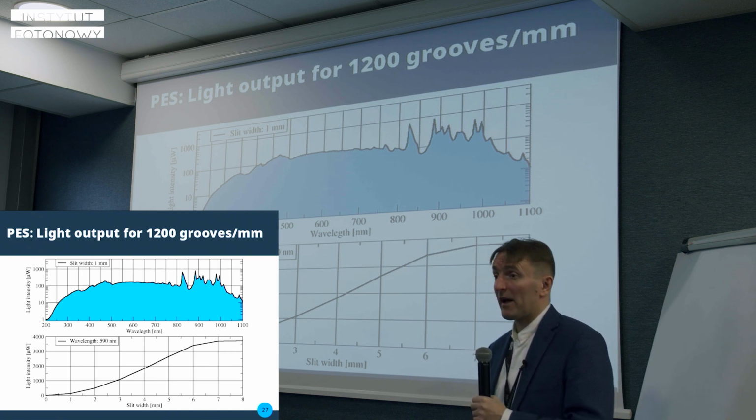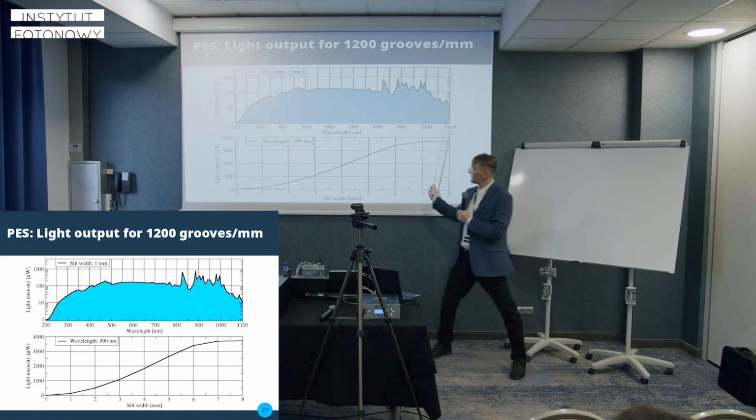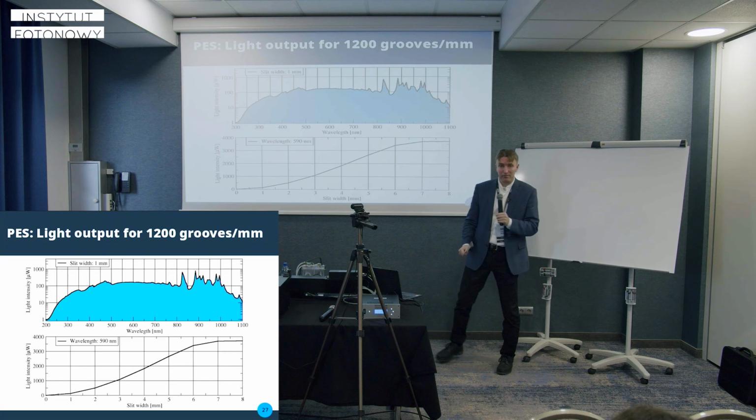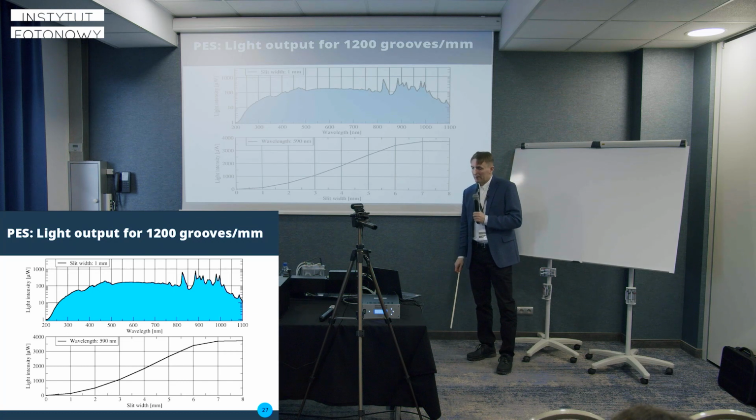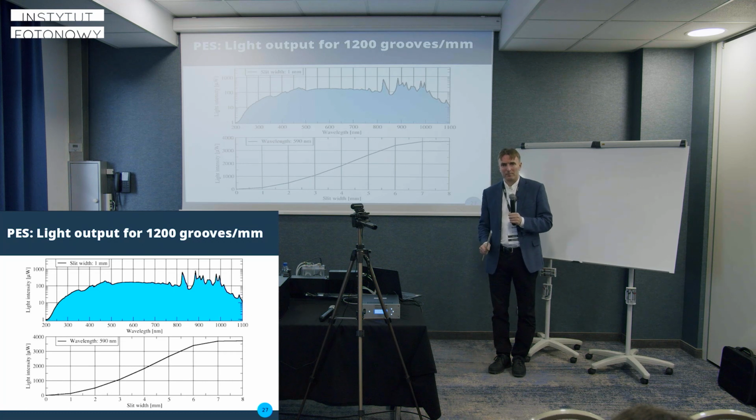For that, we have a simpler device that is called mini photoelectric spectrometer, and it uses LEDs to deliver light. But then you don't have this continuous sweep of frequencies. You have just discrete ones. Now some people say instead of looking for an LED revolver or an LED source, I would open the slits for the monochromator and I will have more light, or I will close them if I want less light.